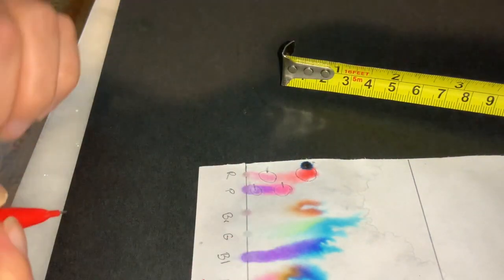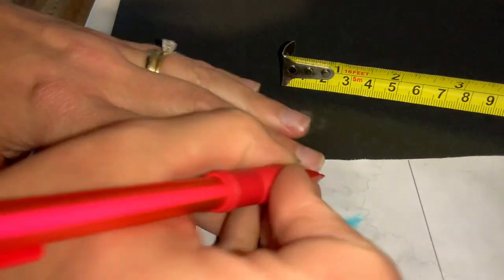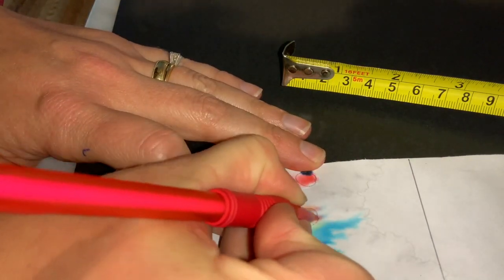Now our brown didn't really separate too much. It looks like most of it moved, so we're just going to look at this spot.